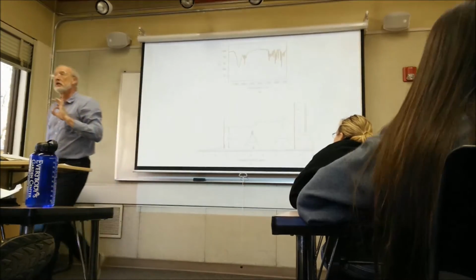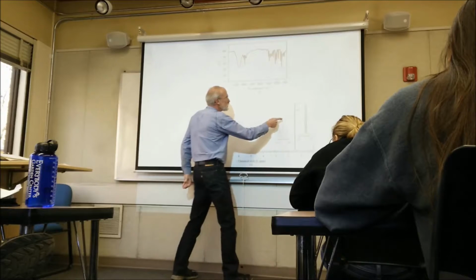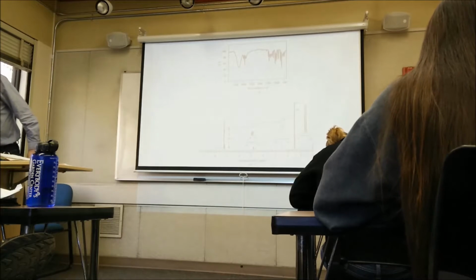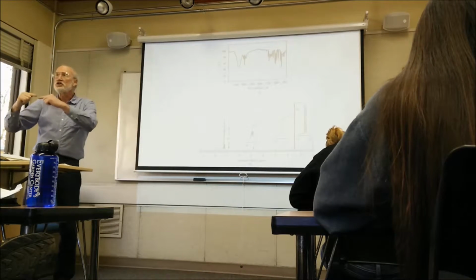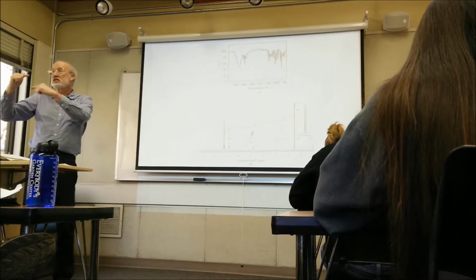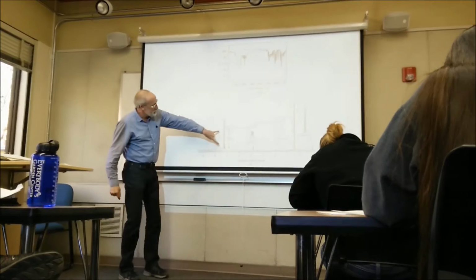Can you explain what you were doing there? I kind of missed it. I added 20 plus 4 plus 4 plus 12. That adds up to 40. And I know from the molecular formula that I have 10 hydrogens. So each of those hydrogens must equate to 4 units in the integration, because 10 times 4 is 40. That make sense? So this is 5 hydrogens.